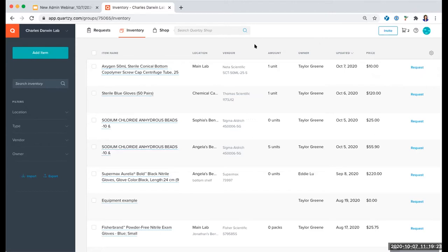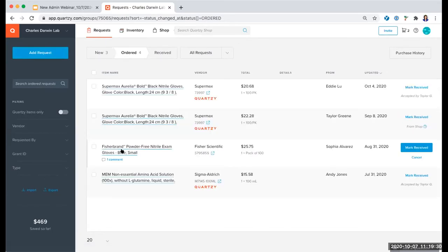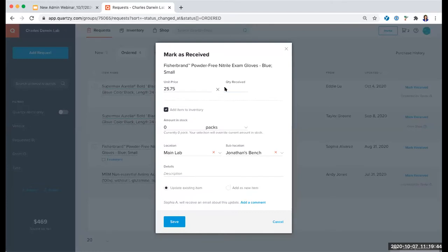A question came in: can you receive a partial order? You absolutely can. When you click Mark Received, there will be an option for you to edit the quantity that was received. So if I ordered two and only one came in, I would change that quantity received to one, click Partial Delivery, and then just that one pack gets added into the inventory. This item would still remain in the Ordered area with just one unreceived item, and I could then go back when that item comes in and mark it received again.